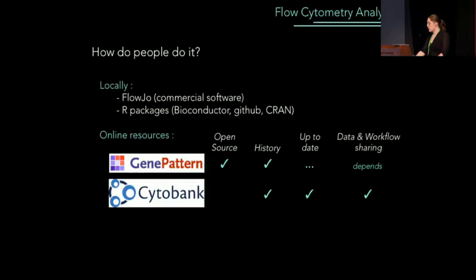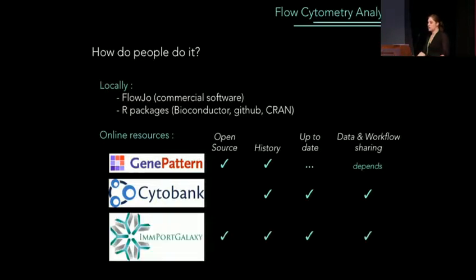And so in that context, well, you guys are convinced already that Galaxy is awesome, so I don't have to convince you, but that's where we wanted ImmPort Galaxy to go. So we wanted something, again, that's open source, that has a history, where you can share your data, you can share your workflow, something that we can keep up to date easily, something where the community can contribute tools that they want to have.